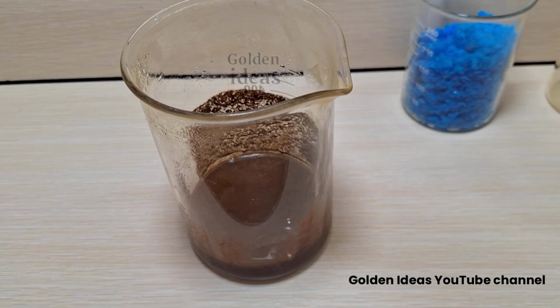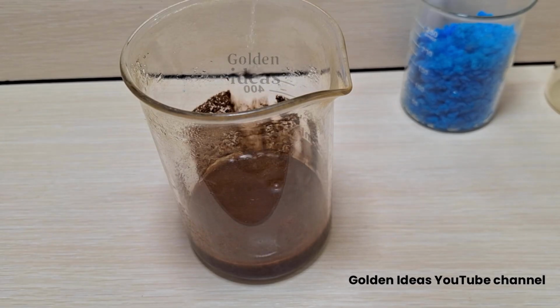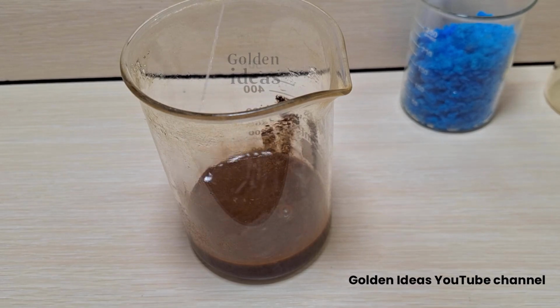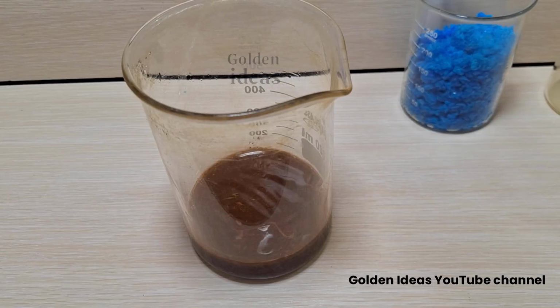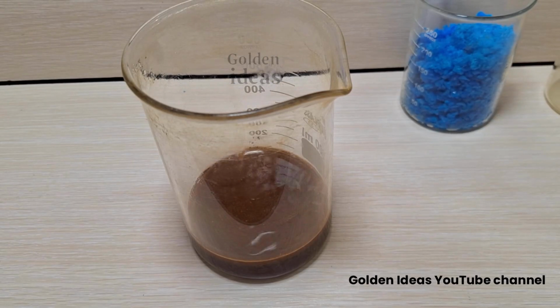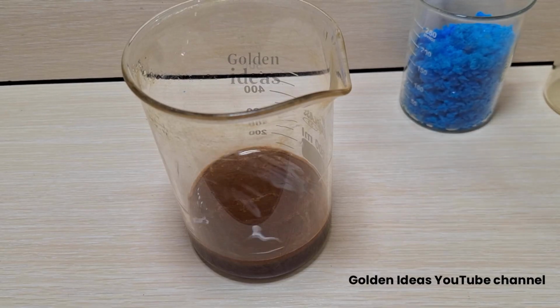I used hot water to speed up the reaction. In this test, use normal water and the temperature is not very important. But it is better if you do it in a warm environment. You can also do this test in a plastic container.